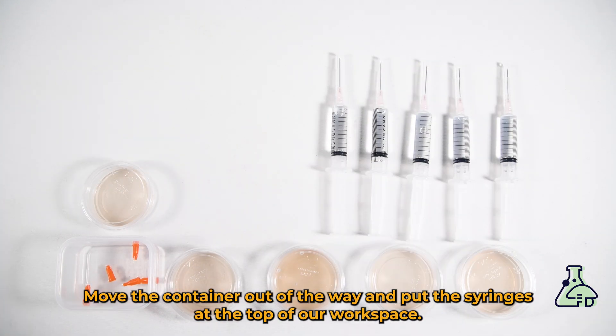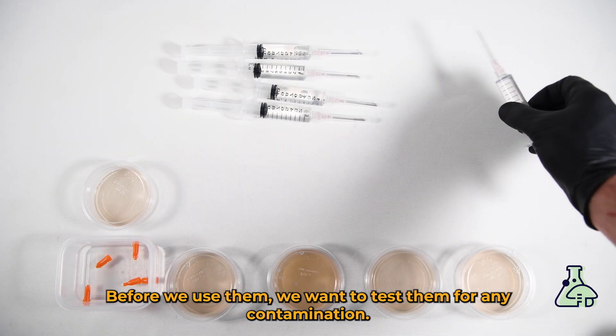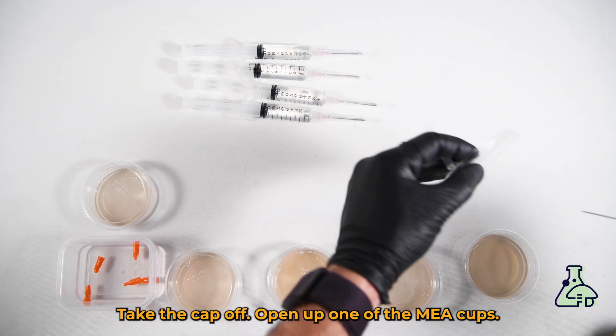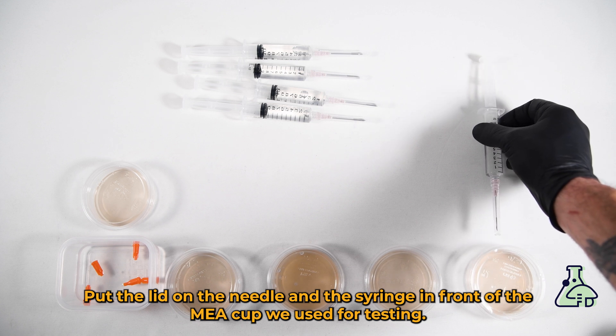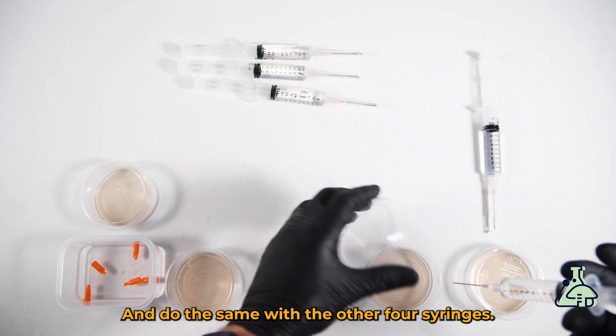Move the container out of the way and put the syringes at the top of our workspace. Before we use them we want to test them for any contamination. Take the cap off, open up one of the MEA cups, and put one drop on it — any more and it could be too wet. Close the cup, put the lid on the needle, and place the syringe in front of the MEA cup used for testing. Do the same with the other four syringes.